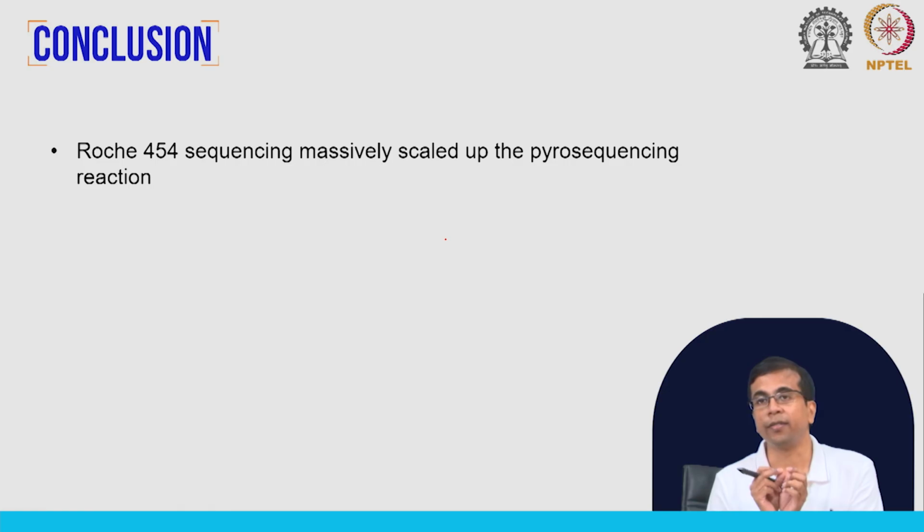So, we start with DNA fragments and then we do something called emulsion PCR in this oil emulsion. What you have is something like micro reactors, and each micro reactor contains one bead and one DNA molecule coming from the genomic DNA, and this genomic DNA is then amplified because there are certain complementary sequences to the adapters already present on these beads. So, this leads to massive amplification, which we call emulsion PCR, within these emulsions.